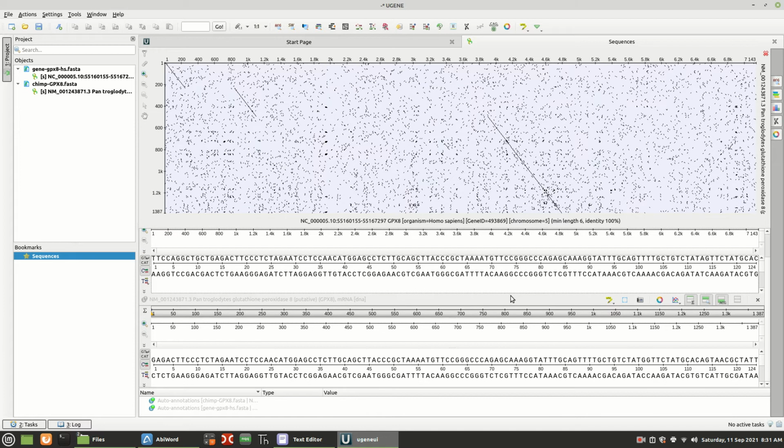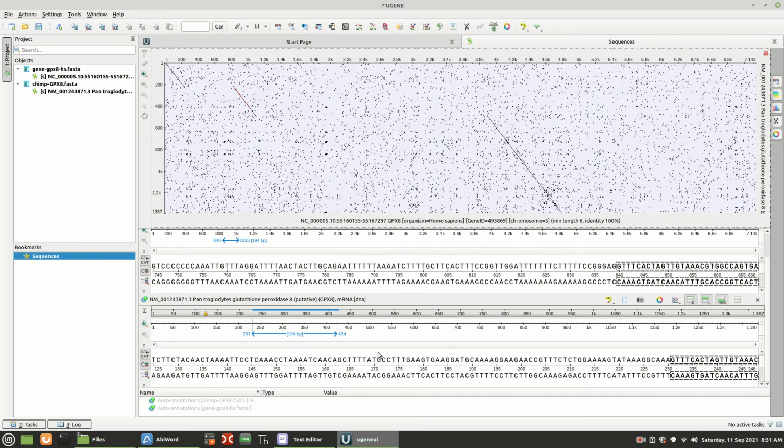We actually can get that here. If I click on, say, this one, alright, it's showing us the same thing BLAST would show us, this right here. But BLAST shows us where they're different. But this is the sequence that we are looking at, and here are the 2 of them. Now they're not perfectly aligned.